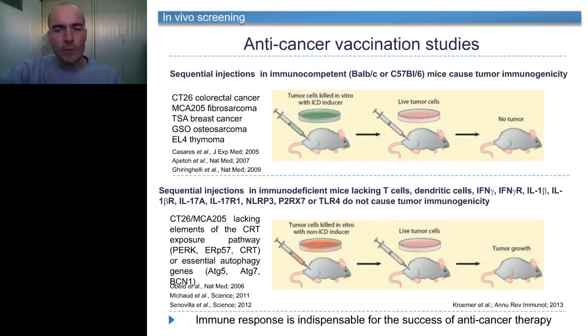Immunogenic cell death is probably best explained on the anti-cancer vaccination model that we used in the lab before we used microscopy to analyze a certain amount of anti-cancer agents. So what we are doing is looking for a bystander effect that chemotherapy can induce while specifically activating the immune system of the host, or in clinical conditions, of the patient.